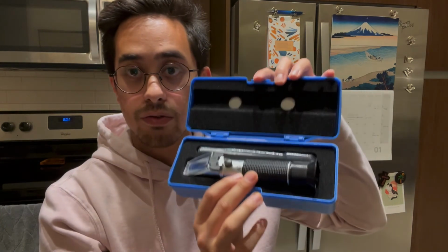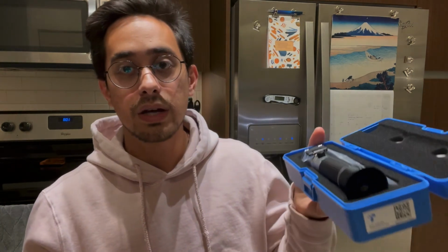The equipment that I have here is a refractometer. What this does is it does something with light and the liquid. I'm not exactly sure what it does, but it's a way for you to measure the sugar content of any sort of liquid. It works best with juice. I've read online that when there's alcohol or acids from kombucha, it may throw off the measurements, but I'm trying to get just a rough measurement. So this should work good enough.